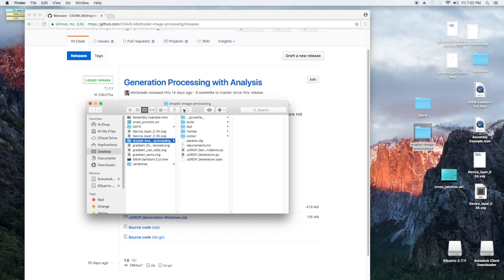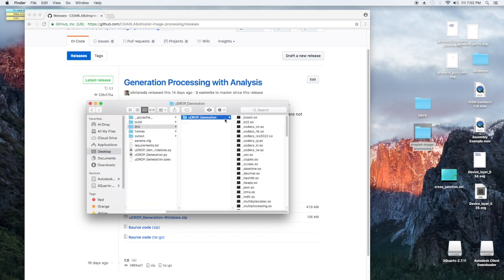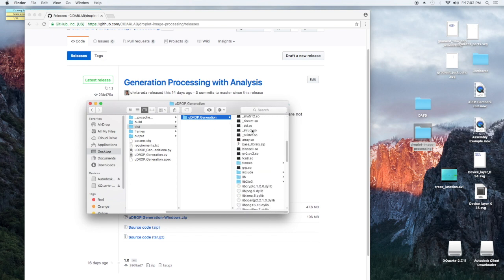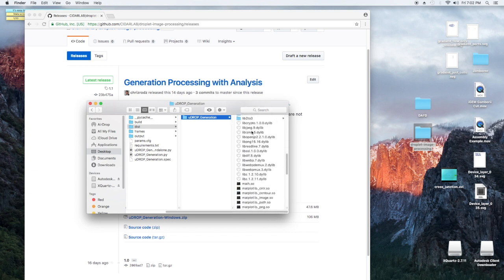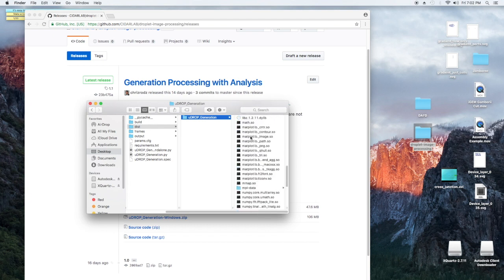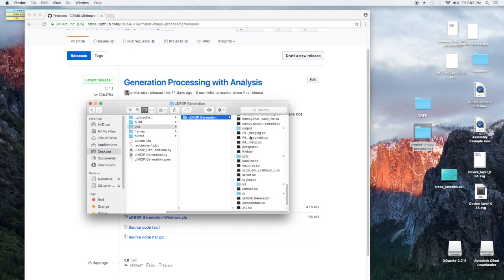Here I unzipped it on my desktop, so here in dist, this is Udrop Generation, this is the unzipped file. So you're going to see when you unzip it a lot of these dependencies, and the one file we care about is called Udrop Generation over here.